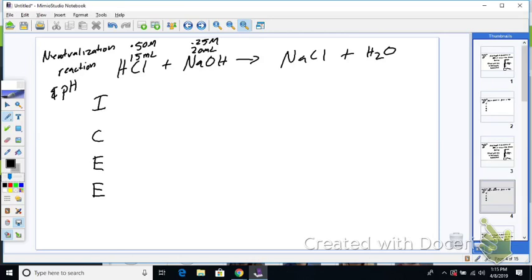Okay, so I think I have base made up. I have acid made up. You guys can get the pH probes out. We used them in another class, so they're already kind of out. You guys will have to calibrate those. Those are pretty easy to calibrate. We'll have you just go through a titration process and see how the calculations work. And if I was smart, I'd give you the 0.5 molar here, but the 0.25 molar I won't be able to give you. I won't be able to make that up. I have 0.20 molar. It'll be real similar to this. Okay. So I'll write down what I have, and then you guys will have yours, and we can compare.